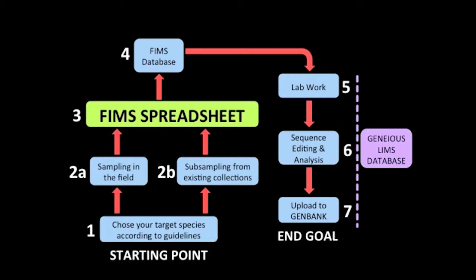If you have questions about these guidelines, please contact your project informatic leads or lab working group members who have access to these documents. After the target species are chosen, the next step in the pipeline is to sample the specimen itself, either from fresh material or from sampling of existing collections. Once collection begins, it's imperative to start populating your BWP FIMS spreadsheet with the sample's associated field data. With a completed spreadsheet, the next step is validating and uploading your spreadsheet to the FIMS database. Data must be validated before it can be uploaded into the FIMS database. Once the FIMS spreadsheet has been uploaded, the physical processing of specimens in the lab could begin.